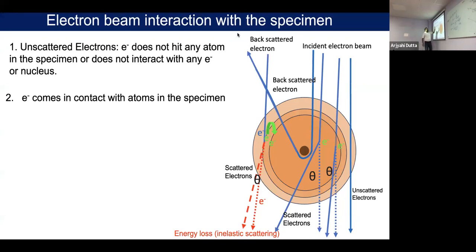So here you can see this is an atom. One electron, there is no scattering, no interaction, it is passing through the atom. And this is always good. It is not interacting. We have some friends who don't want to talk to anyone. They stay on their own, checking the cell phone, just eating and going back to the room. They don't want to interact with anyone, so they are not creating any problem or any happiness for anyone. It is something like that, the unscattered.